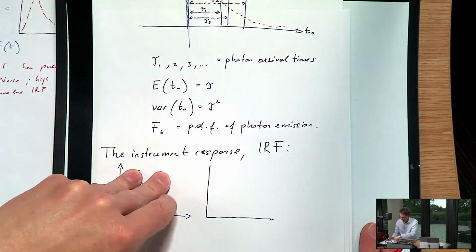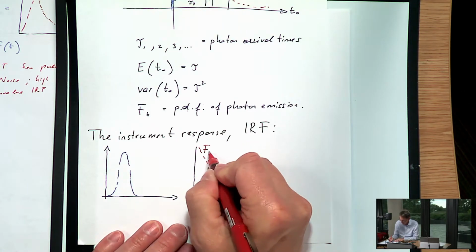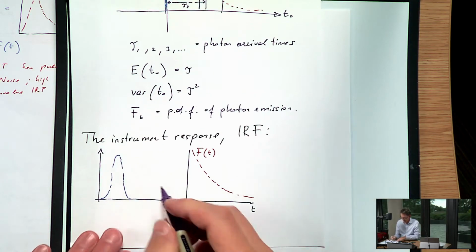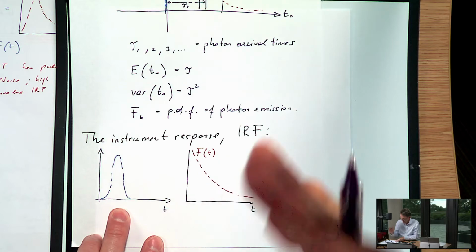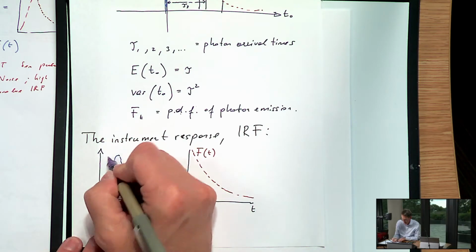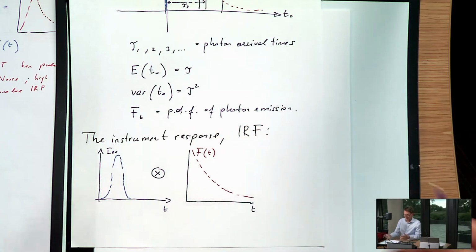So this would be this delta function response. It looks like this, right? So that's f of t. So we have t here and t there, and in reality, of course, the response of the molecules to this excitation pulse IEX is a convolution of this profile here with the impulse response function.